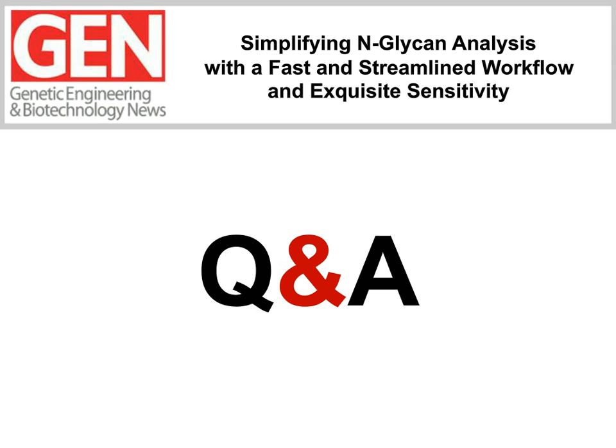And does UNIFI have a glycan library corresponding to RapiFluor labeling for glycan identification? First, I should explain that UNIFI is one of our instrument control and data analysis software suites. It is quite well developed for glycan analysis in this regard. We will, in the second half of this year, be incorporating an initial, call it startup, glycan library for RapiFluor-MS labeled glycans. This is something that we've been developing with NIBRT and should help significantly in making glycan assignments.